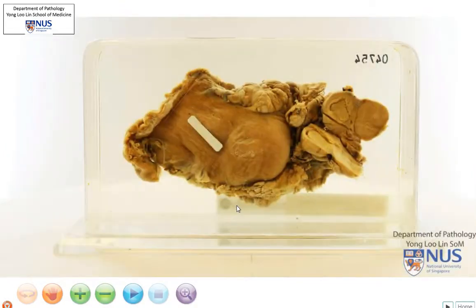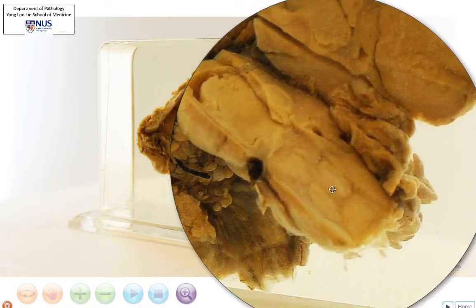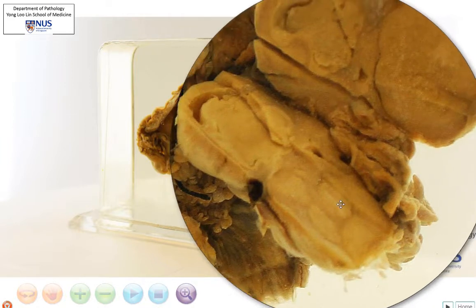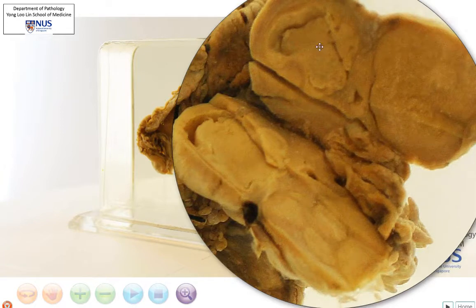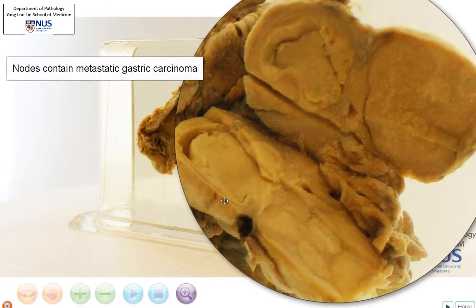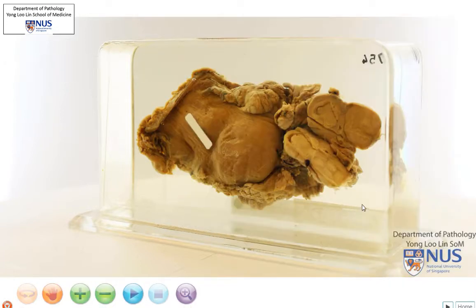When we talk about malignant tumors, we are always concerned about how far they spread. In this case, we are able to see some lymph nodes here, and in fact several lymph nodes that have been stuck together — they are enlarged and matted. This is what we describe lymph nodes as when they are stuck together, and we can clearly see that there are fleshy tumor deposits within these lymph nodes. So this tumor has already metastasized to the lymph nodes, and the nodal staging will be at least N1.